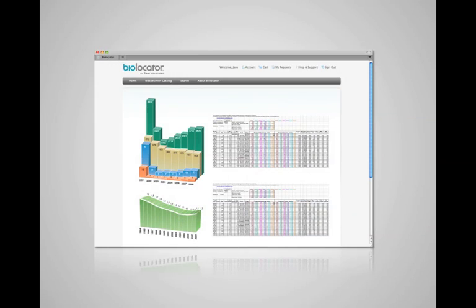With all that it does to help you manage your tissue distribution, BioLocator also has extensive reporting. You can report on where your tissue is, what has been sold or returned, as well as feedback on the tissue quality.